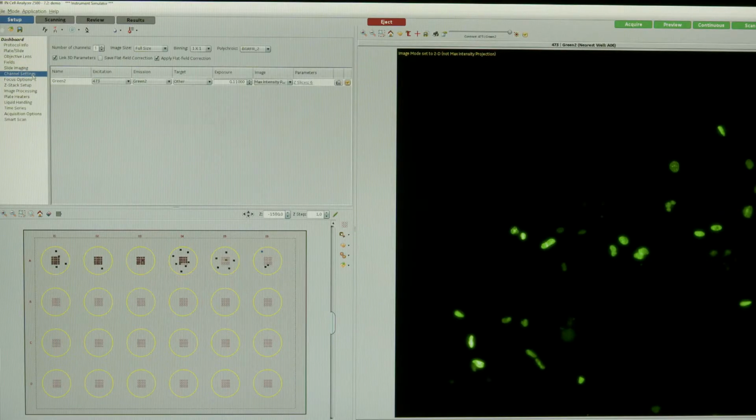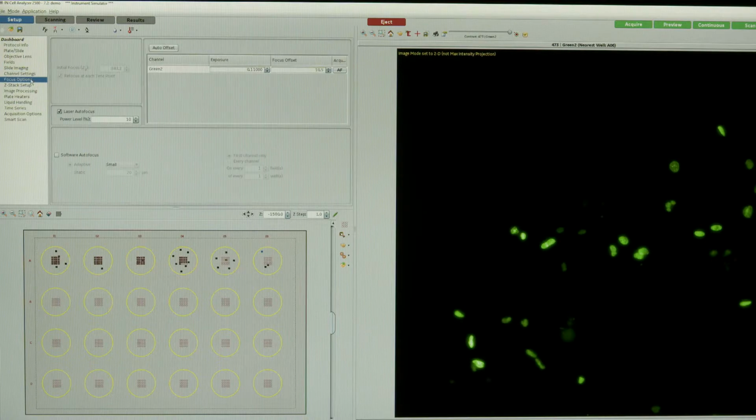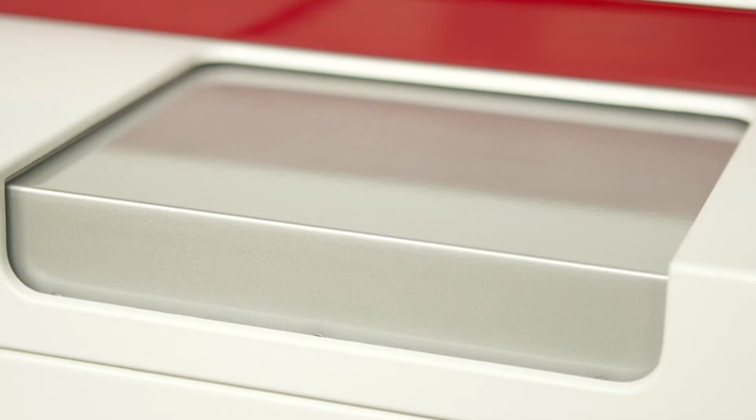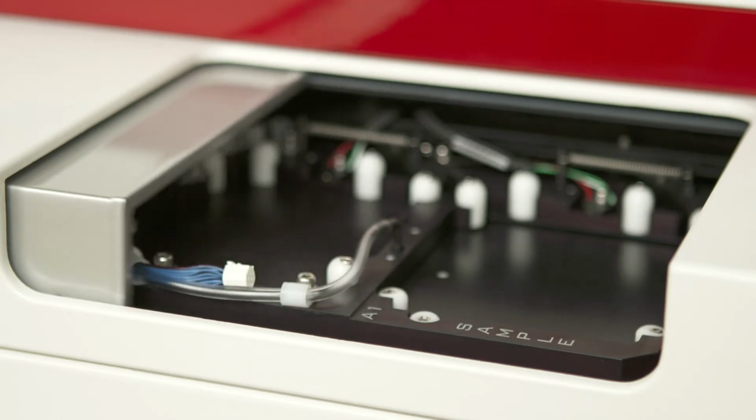Has this technology made your research easier? Almost on a daily basis, we come up with more and more projects that we can use the high throughput image analysis for. And so I think this kind of software and these kind of instruments will actually be adaptable in a variety of different labs. So they can add image analysis to their other types of analyses that they do. So I think it's going to be transformative in that respect.